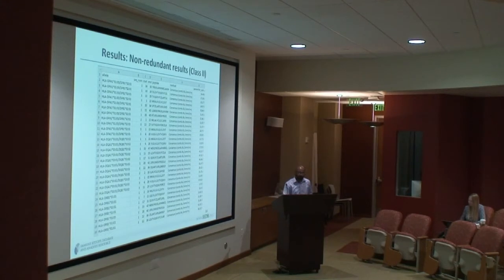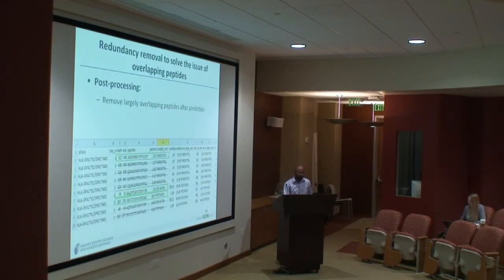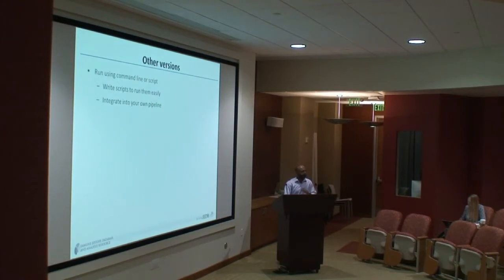So these are the results in the CSV format and post-processing that I already mentioned. So we already removed this redundancy, so you don't have to worry about that. So that's about the TEPI tool. I think it's kind of intuitive, and you can go and try it out and let us know if you have any question or you get stuck with something, and we'll be happy to answer.